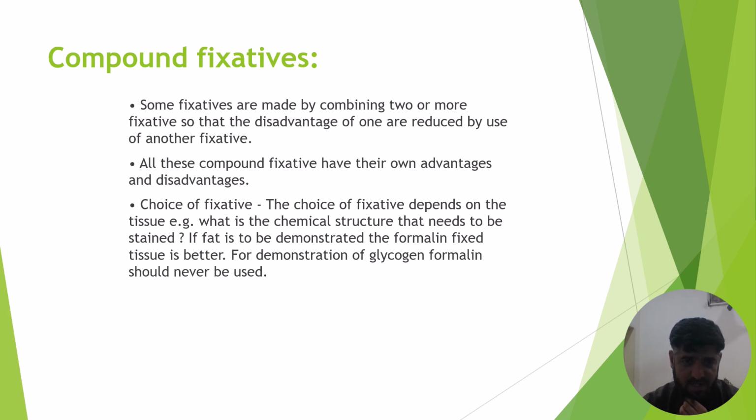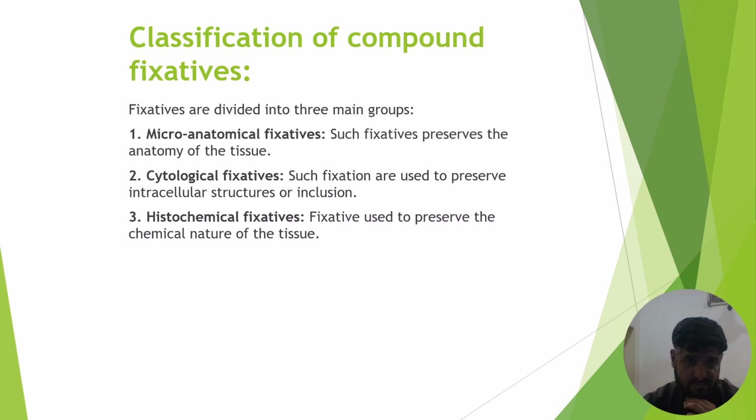What is the chemical structure that needs to be stained? If fat is to be demonstrated, the formalin fixed tissue is better. For demonstration of glycogen, formalin should never be used.